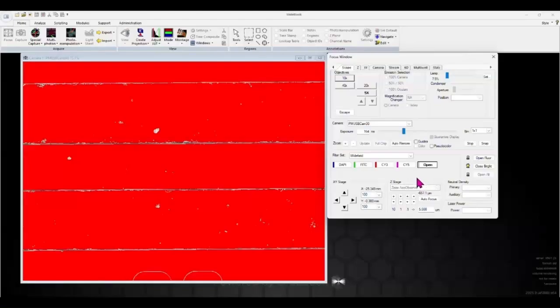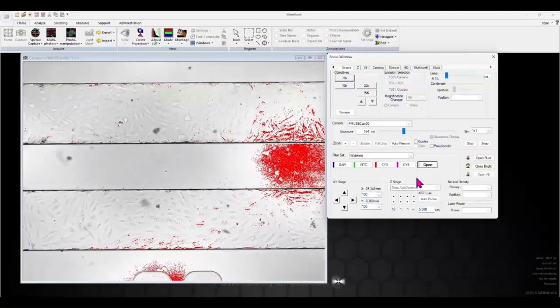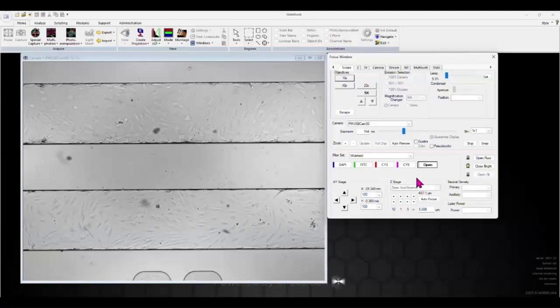For the in-lab portion of the demo, we've prepped two low-shear 48-well BioFlux plates. We've placed our first plate on the microscope and are viewing it live using our imaging software, Montage Plus. We're adjusting the lamp exposure so that you can see one viewing window with two microfluidic flow cells, one at the top and one at the bottom, each seated with human umbilical vein endothelial cells, or HUVECs.